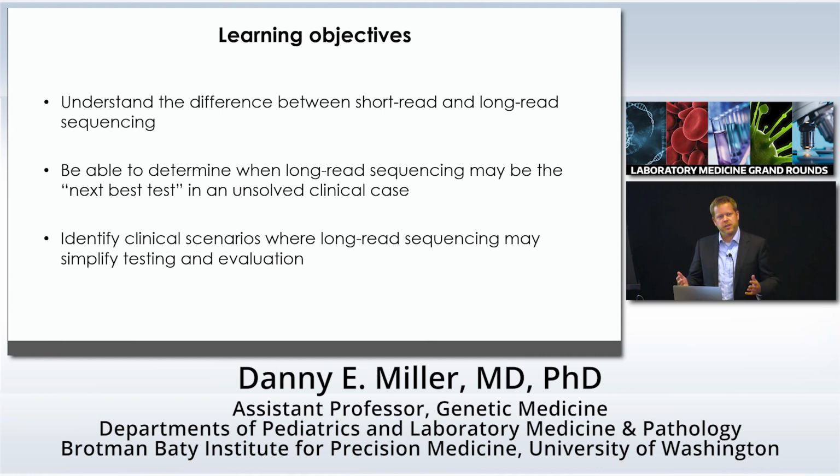And then just learning objectives for today. I think the big picture as we talk about long-read sequencing: understanding the difference between short and long-read sequencing, thinking about when you can use long-read sequencing, when it is the next best test, and I'm going to go through a couple of example cases. And then just ideas about what it could do that I'm not thinking about today. What are some novel applications of this technology?